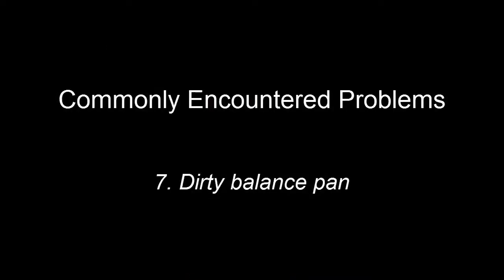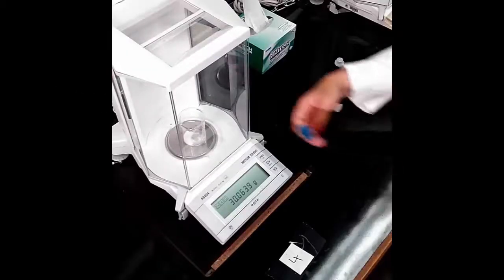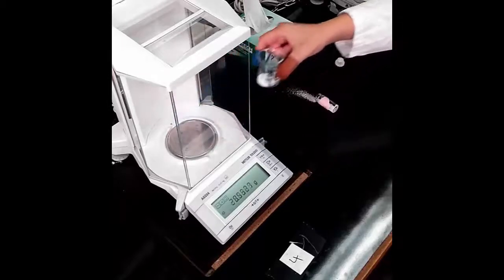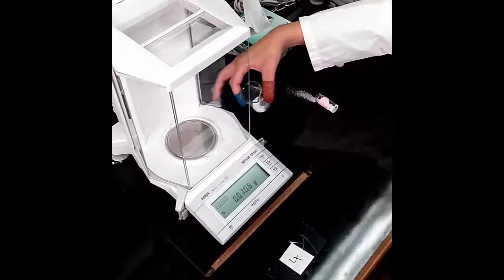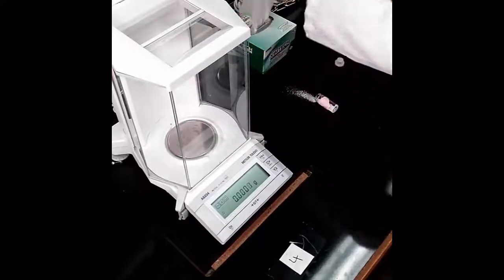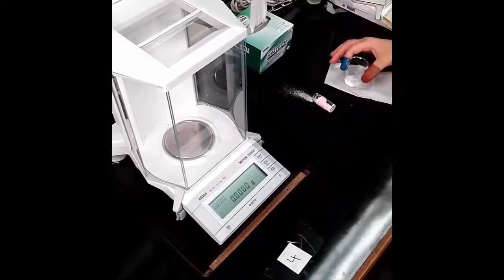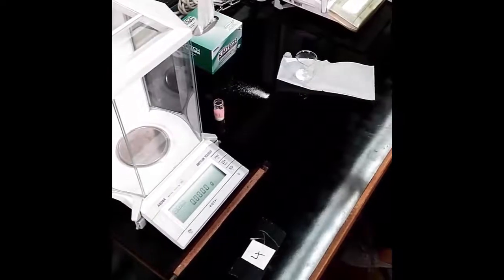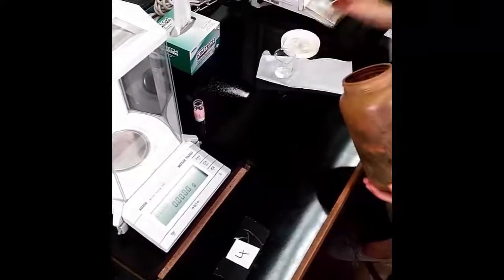7. Dirty Balance Pan. If you happen to knock over the vial and spill sample on the bench, place the beaker on a kimwipe to prevent particles from adhering to the outside of the beaker. Immediately clean up the mess. Be sure that any spilled solids are discarded into the solid waste container.